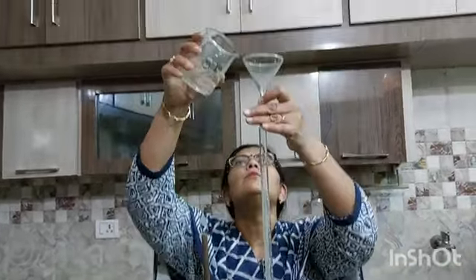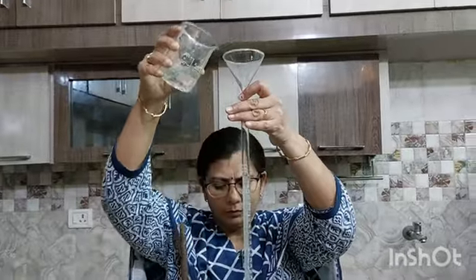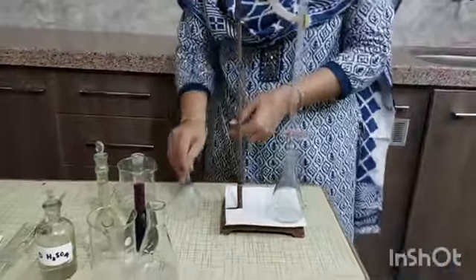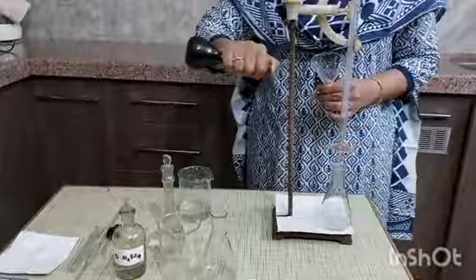First, rinse the burette with water, and then rinse with KMnO4 solution.